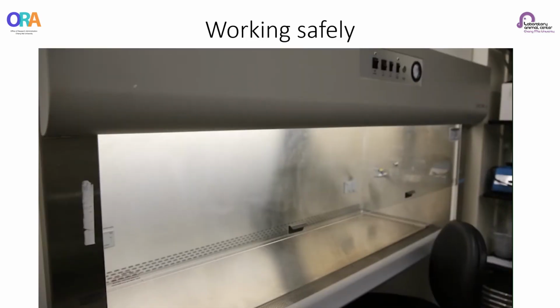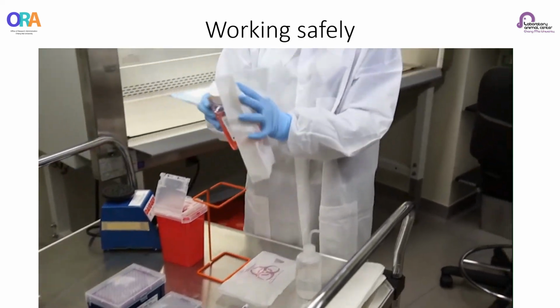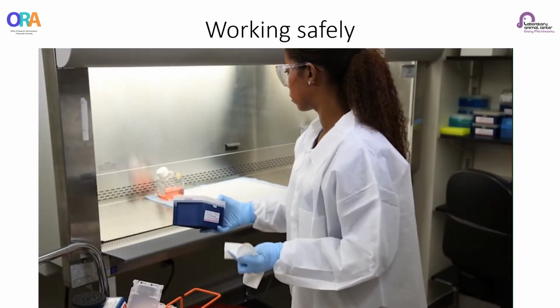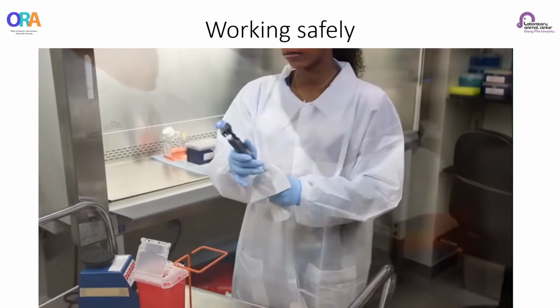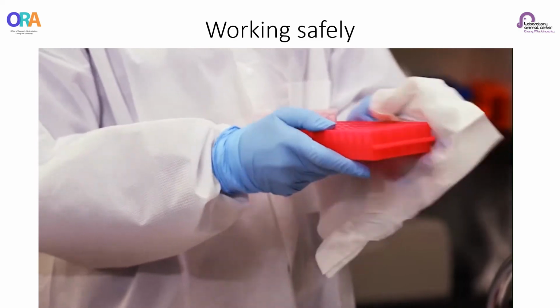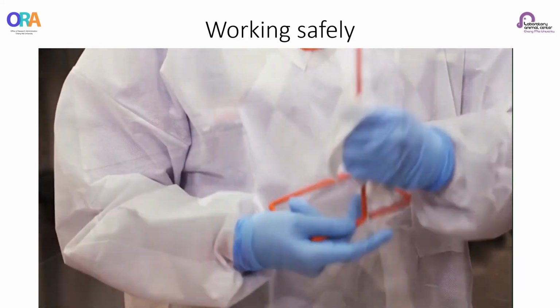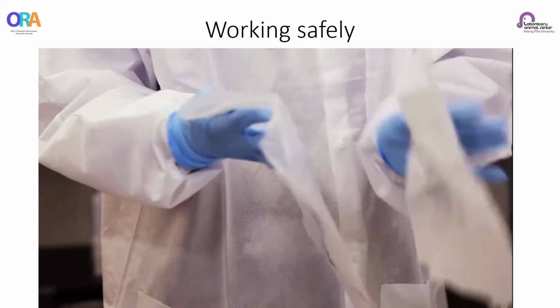Before loading the BSC, it is a good practice to wipe the external surfaces of all needed supplies with disinfectant to reduce the introduction of outside contaminants into the cabinet. It is recommended to load necessary materials once in the beginning to minimize your arms entering and exiting while working. Don't forget a biohazardous waste container, sharps container, paper towels, or wipes.